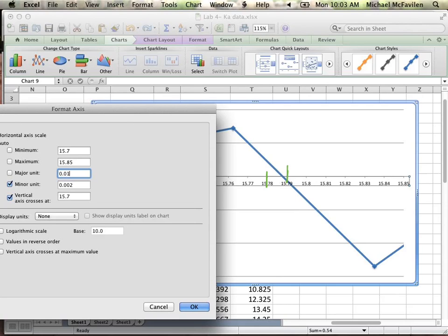So like, let's see, like 780. Okay, there we go. You now have an equivalence volume. Okay? Compare that back to our other volumes.